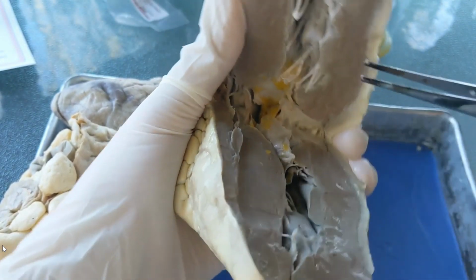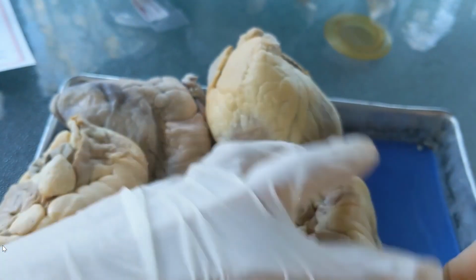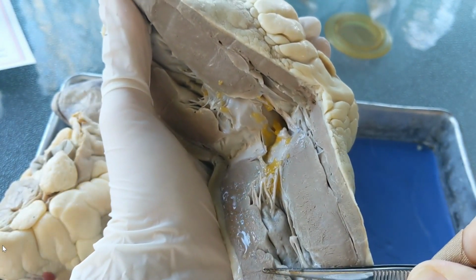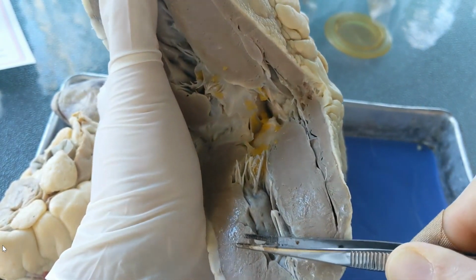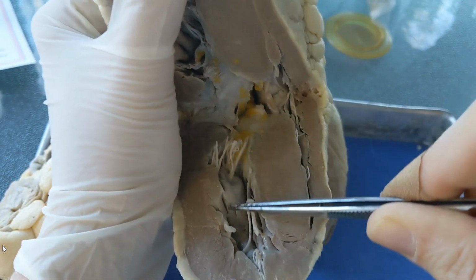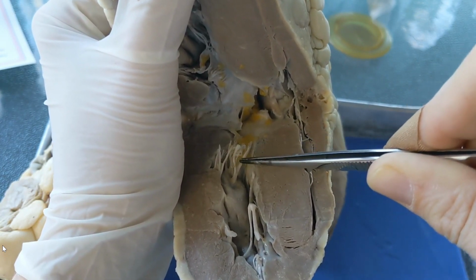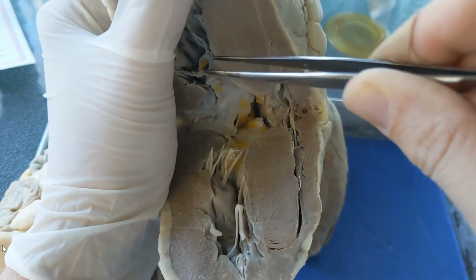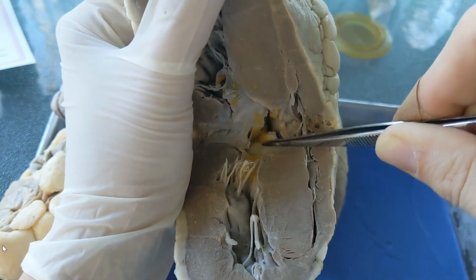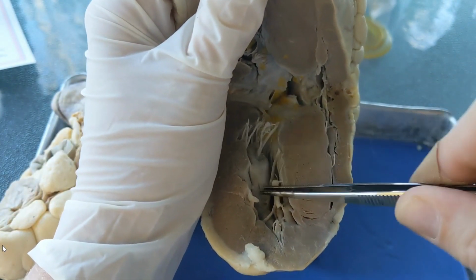Ew. Sorry, I'm not a doctor. Can you tell? Okay, so you check out the valves, see if there's anything strange about these valves, such as disgusting discoloration. Note which valve. So you should know which side of the heart we're on here, the bigger side. What is the valve that separates the atrium from the ventricle on the left side of the heart? That's where I am seeing most of this, on the left side in that atrioventricular valve. So you should definitely know which valve that is. If you're not sure, figure out which one's between the left atrium and the left ventricle.